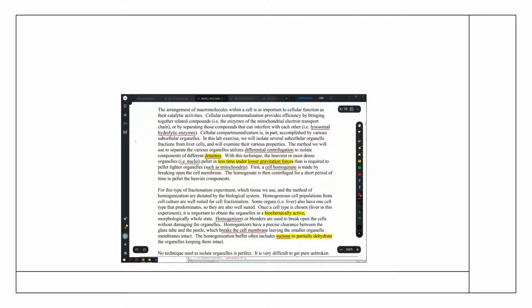So for example, we have our centrifuge tube here, and it says that the nucleus is really heavy. So our first centrifugation was 1000 RPM for 10 minutes. And so we got a pellet down here, and then we had supernatant. The supernatant is the liquid. So they're saying that after our first centrifugation of 10 minutes at 1000 RPM, we were able to pellet the nucleus because the nucleus is more dense, okay? But the mitochondria was still hanging out in the supernatant, okay?